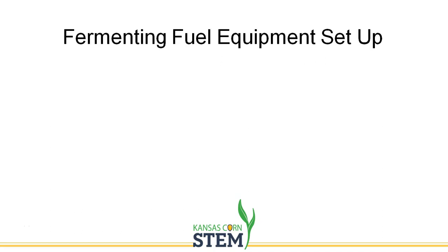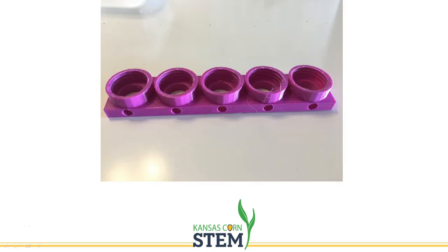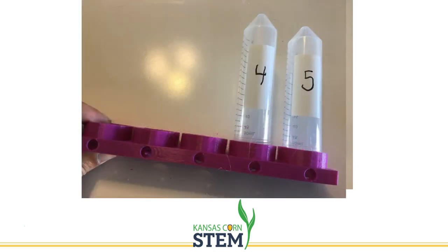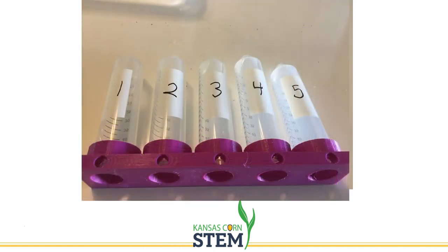Now I'll go over a few tips for setting up your equipment that was provided by Seed to Stem. In your tote, you should find 4 3D printed manifolds. The PLA that these were produced from is manufactured using cornstarch. You should also find 25 50 milliliter centrifuge tubes. Remove the lid from the centrifuge tube and carefully thread it into the manifold. Repeat this 4 more times until all of your centrifuge tubes are in place. Try to make them as straight as possible. These have been numbered so students won't confuse their data points.